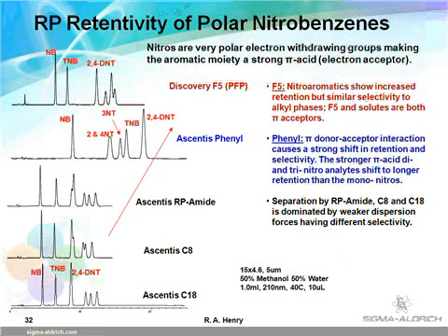The extra retention for phenyl and PFP is believed to be due to formation of strong pi-pi complexes between solute and stationary phase. Nitroaromatics are pi acids, while the phenyl phase is pi basic, which can help explain the stronger attraction. Note that C18, C8, and RP amide are about equally retentive, which suggests that the interaction is coming from the alkyl chain and is mainly dispersive in nature for these compounds.